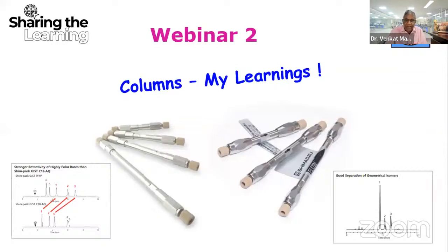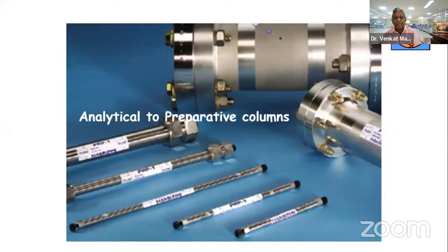Today, the HPLC column, as most of you are using HPLC columns, starts from 10 millimeter length or smaller than that. It goes as high as 50 centimeter column or 500 millimeter column length.